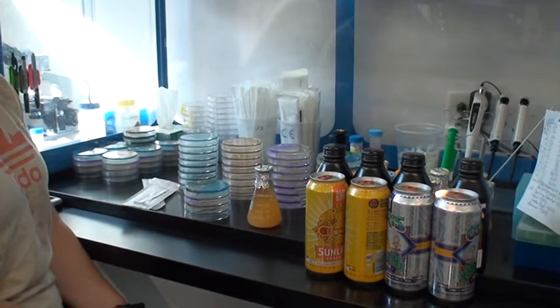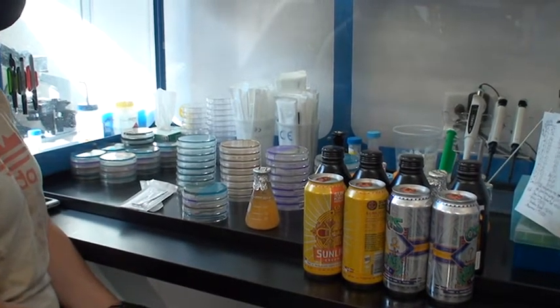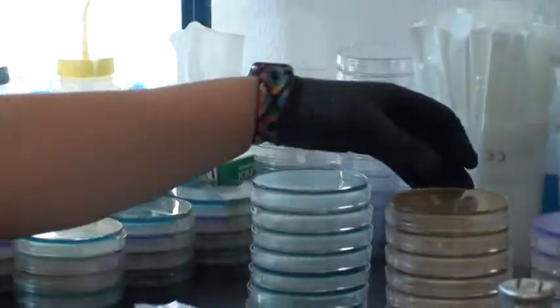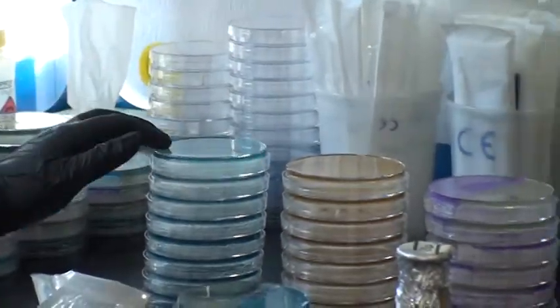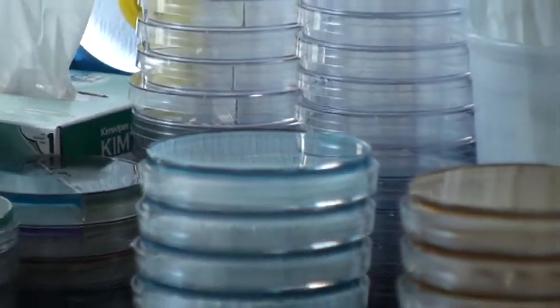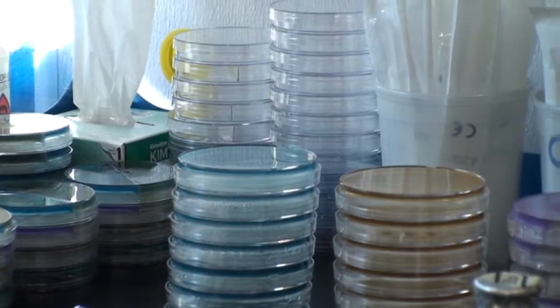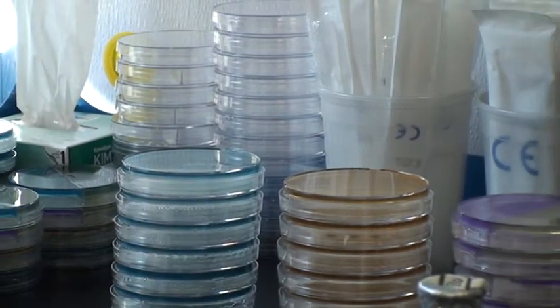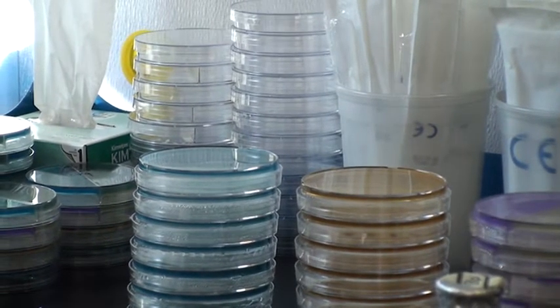With our plates, today we're actually running six different medias — we usually only do four, but Fridays we do a little bit of everything. The first one is WLD, a Wallerstein Lab Differential media, that is for the detection of bacteria. The indicator inside the media itself will change color in the presence of acid. Any lactic acid producing bacteria — lactobacillus, pediococcus, the main ones we're afraid of in the brewery — will turn that plate from a blue color to a yellow color.